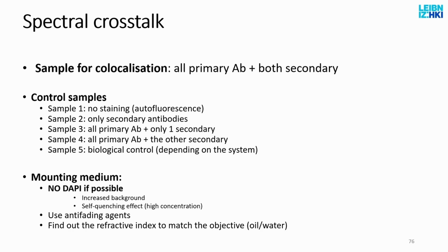There are red labels, but I know biologists don't like them. I don't know why, and I accept it. But if you don't need the nucleus, then please don't use it. Or take a transmitted light image and I'll get the nucleus from there. If you only need to know where it is, or how many, I can do this from there. And we will learn it. So you don't necessarily always have to label it.